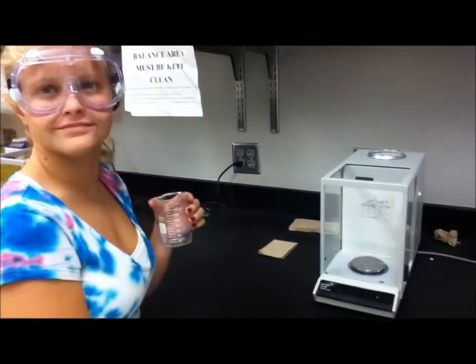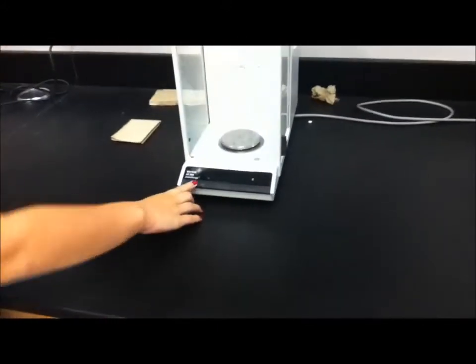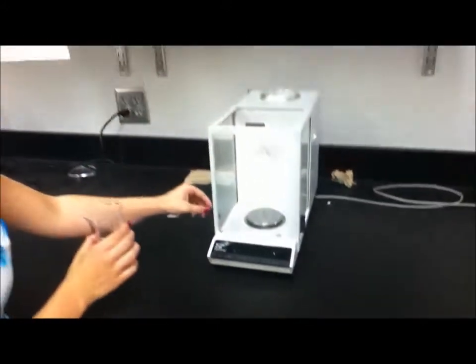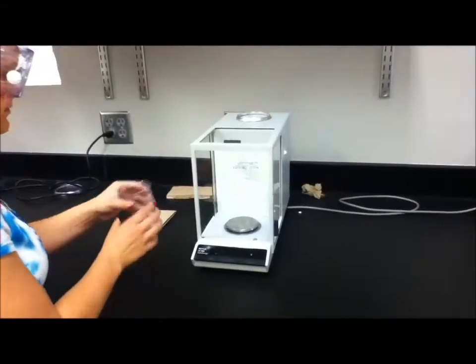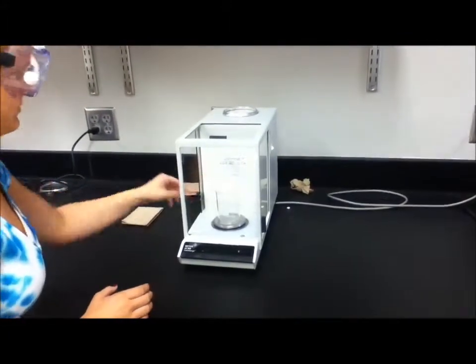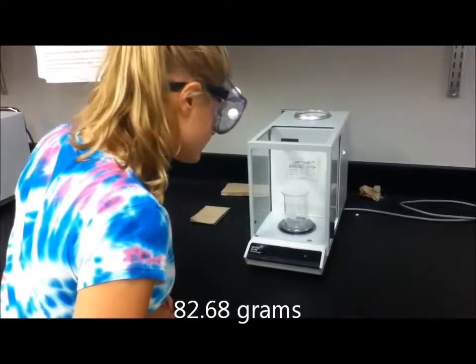Anna is first taring the balance to make sure that the scale reads zero. Then she places the beaker in the balance, making sure to close the door. Make sure to record the reading in your data table under mass of the beaker.